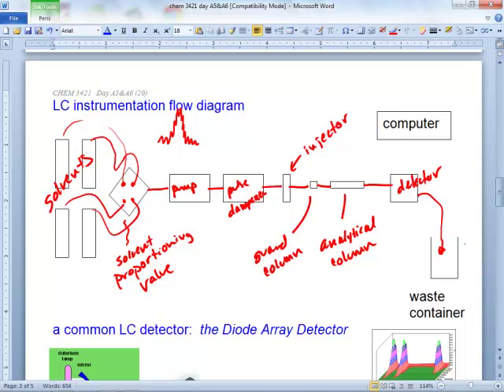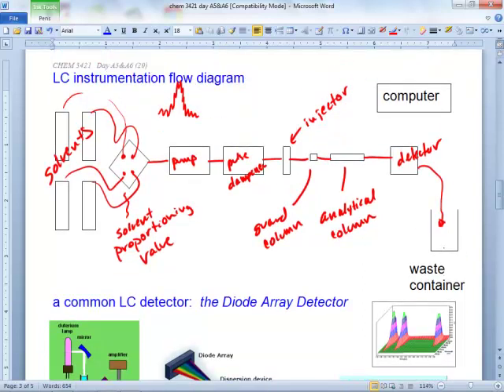And analyze it, try to figure out what's going on there. What part is the computer hooked up to? Oh, yeah, let's make little dashes for electronic. Okay, he should be hooked up. Good question. He definitely has to be hooked up to the solvent proportioning valve.